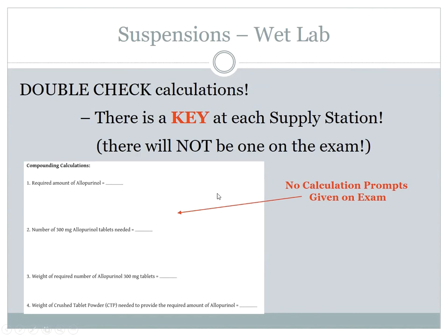Good news is for the hydrochlorothiazide, it does end up being an exact number of capsules. So you don't have to set up the proportion for the hydrochlorothiazide. What's interesting, though, just to deal with some questions we've had all week, when you open up the hydrochlorothiazide capsules, regardless of how many you need to open, it turns out you don't need the weight of that powder. Unlike when you made capsules, you needed to know the weight.